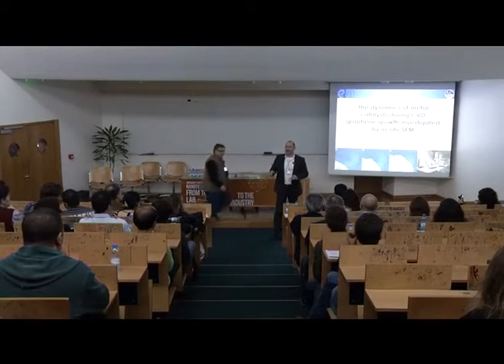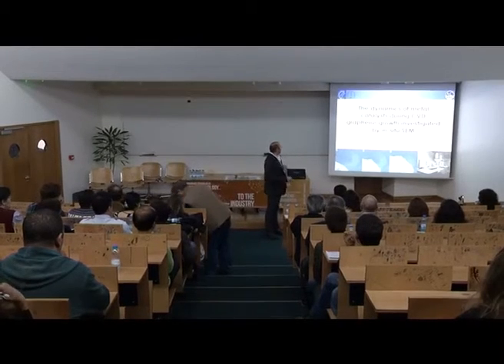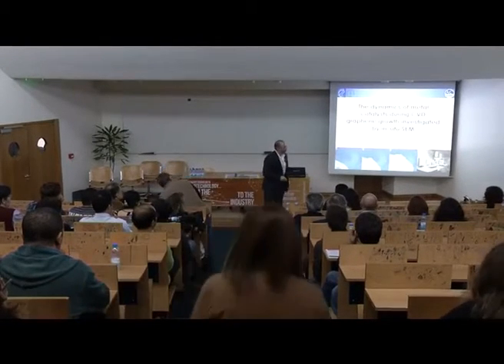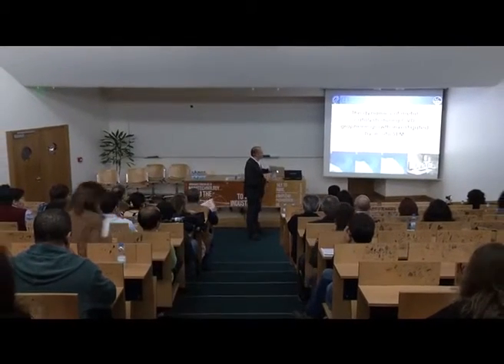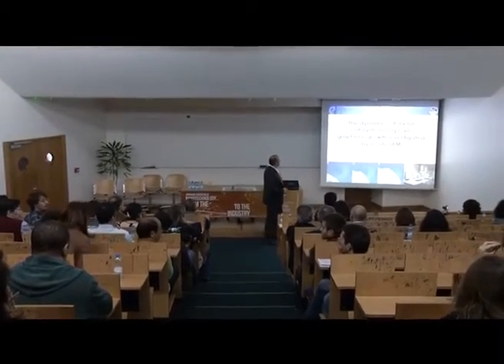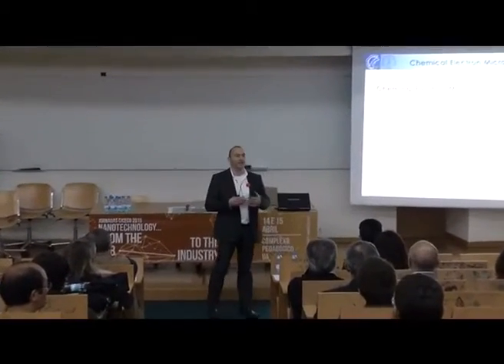First, I want to thank the organizers for having me here. It's a pleasure. Today I'm going to speak about the dynamics that we observe when we look at these materials in the microscope under reactive conditions. What we're doing in Berlin is trying to understand how catalysts actually function.